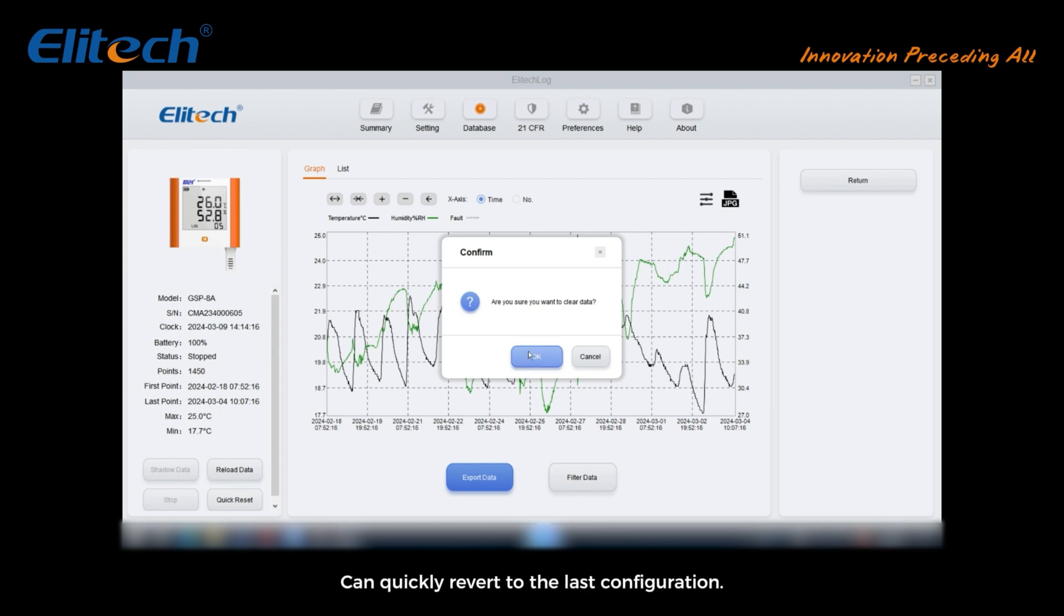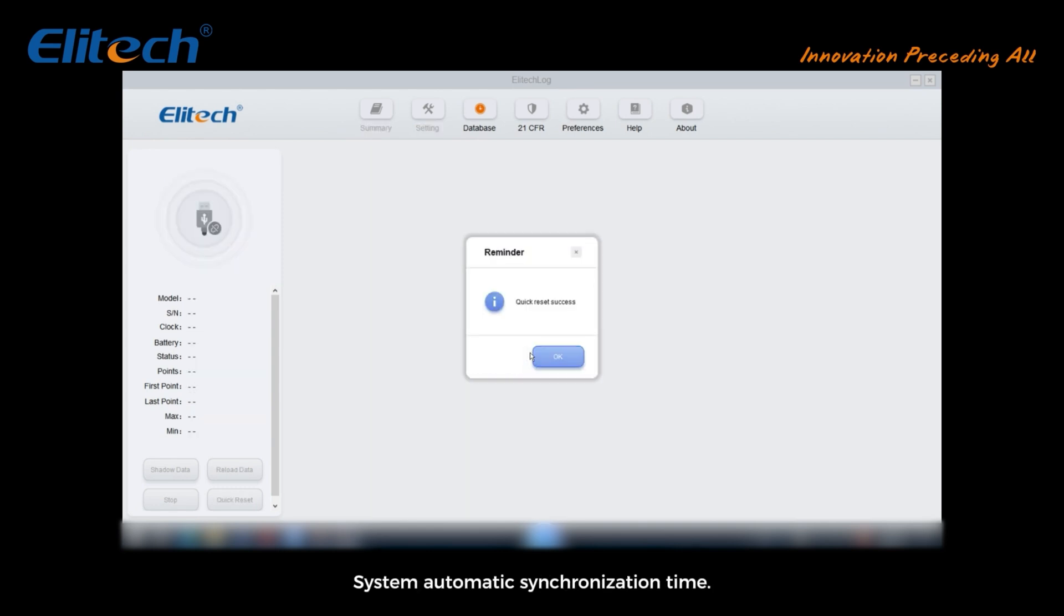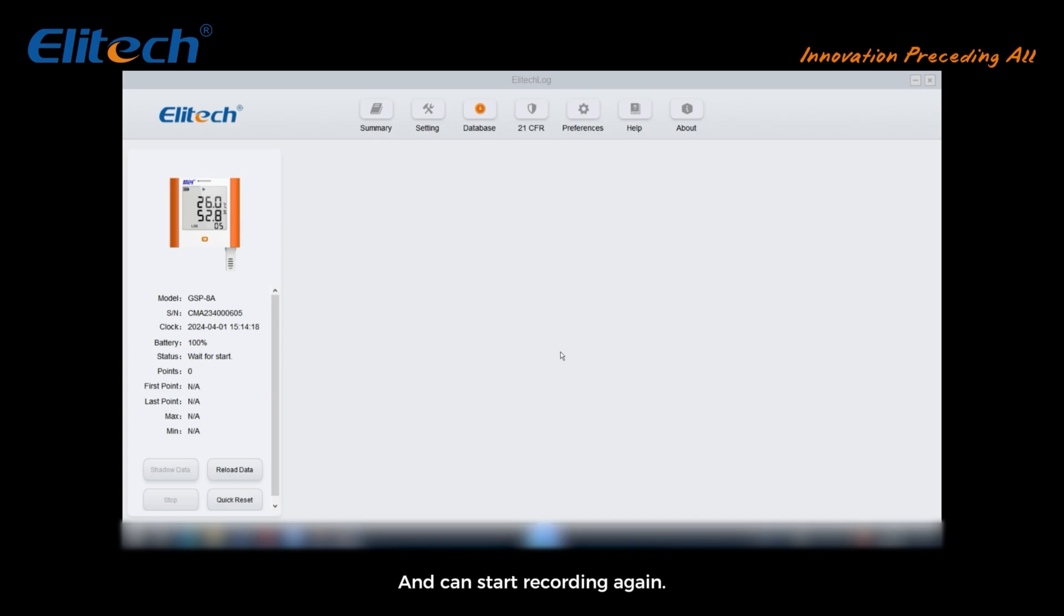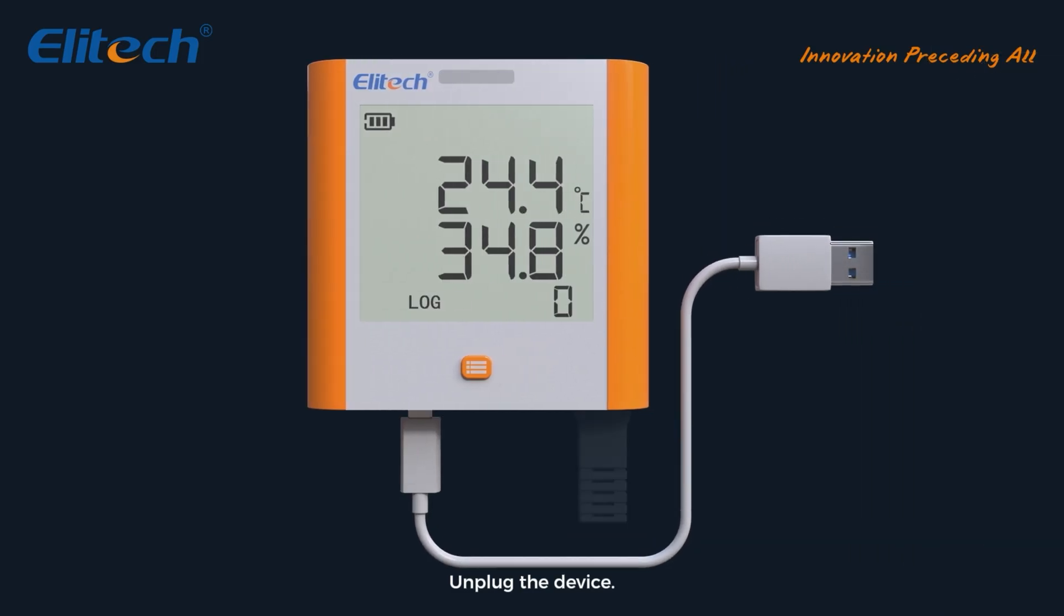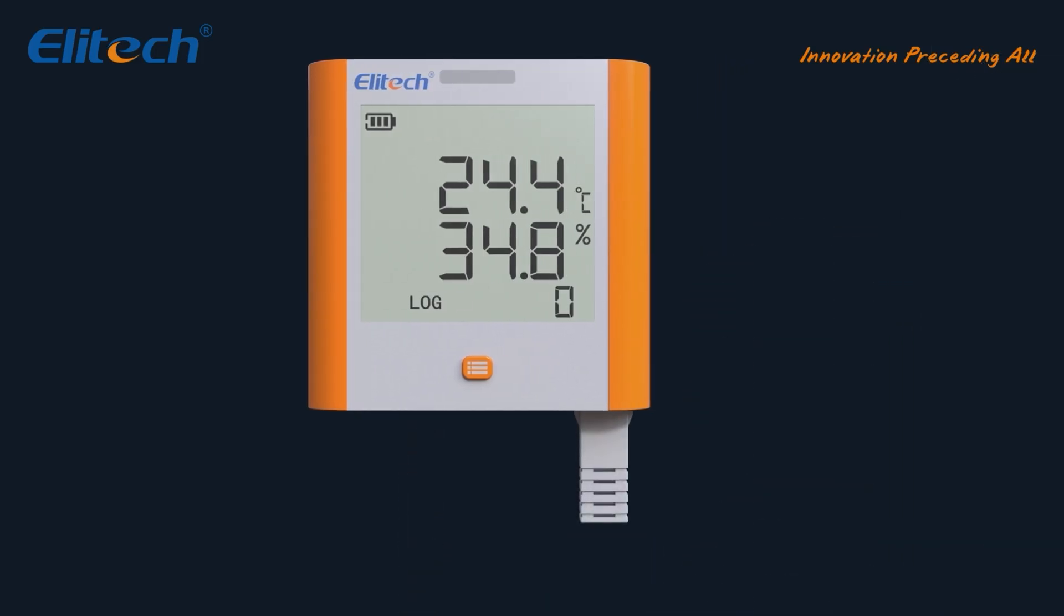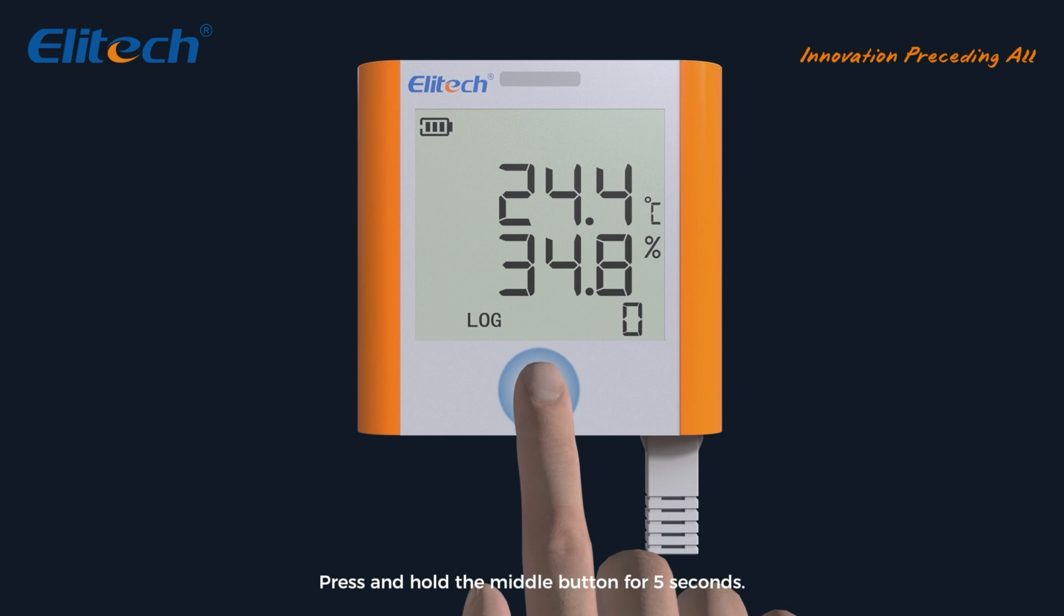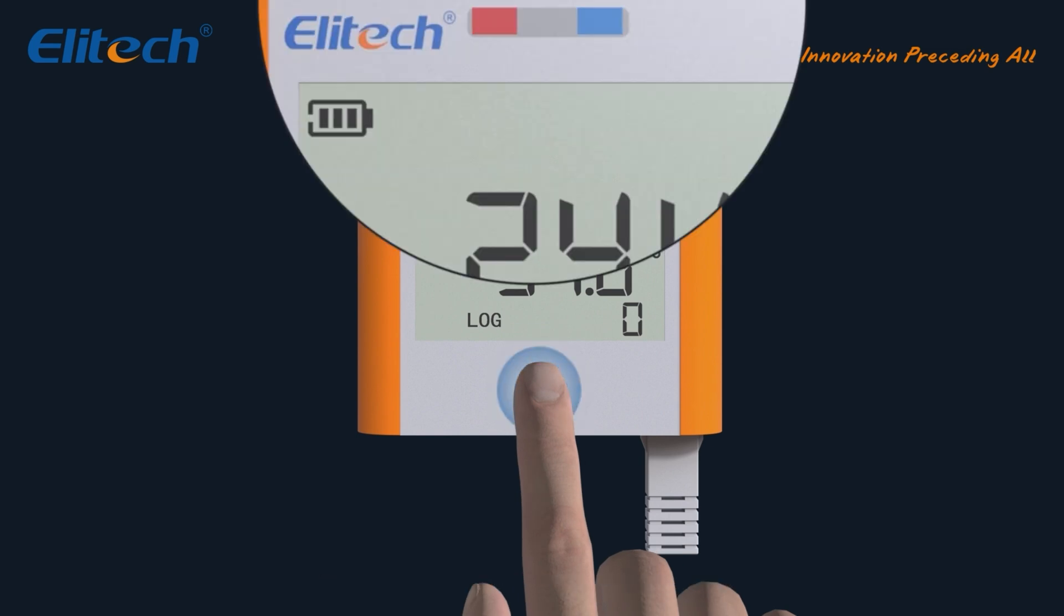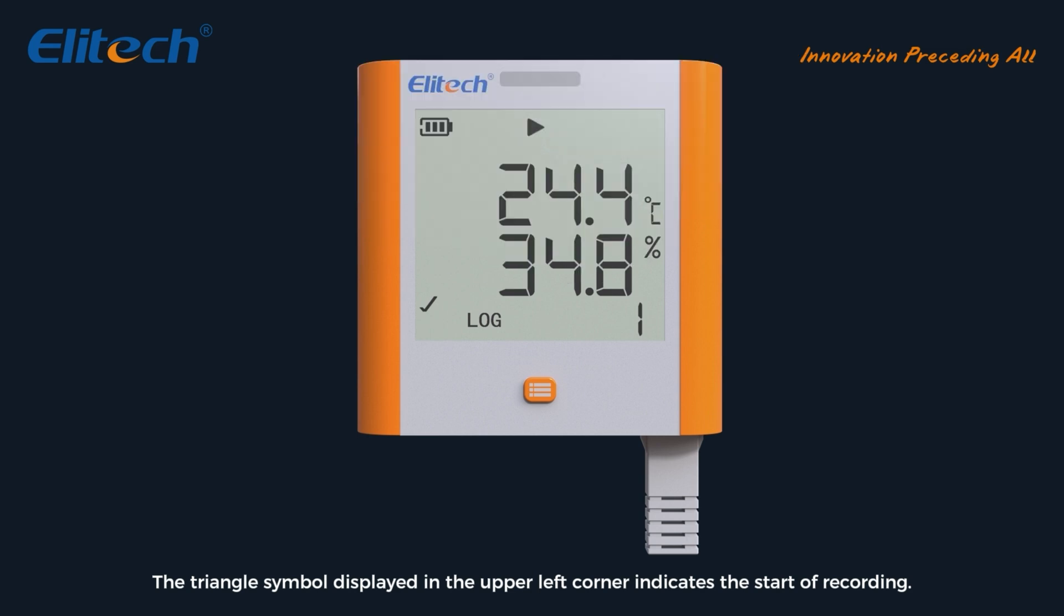After making a backup, click on quick reset in the lower left corner. Can quickly revert to the last configuration, simultaneous formatting of data. System automatic synchronization time and can start recording again. Unplug the device and press and hold the middle button for five seconds. The triangle symbol displayed in the upper left corner indicates the start of recording.